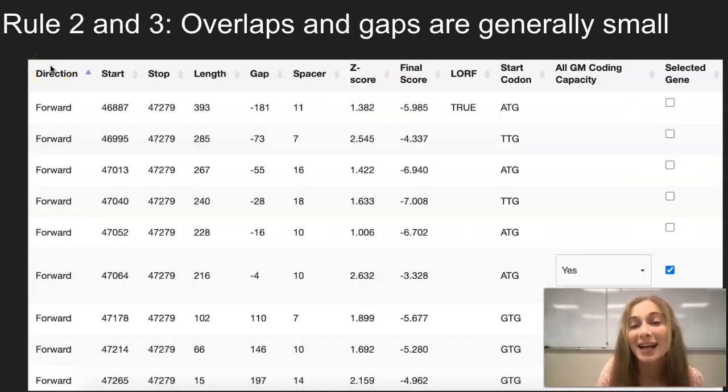Rules two and three talk about overlaps and gaps and how they're usually pretty small. In this column right here, overlaps are the ones with the negative sign and gaps are the ones with the positive sign. The general rule of thumb is that the largest acceptable gap or overlap is 30 base pairs. Because in nature, genes are very tightly packed, so there's not a whole lot of room for gaps.